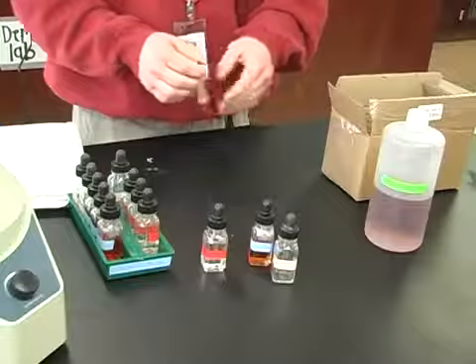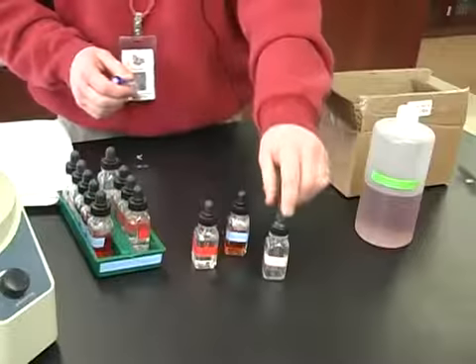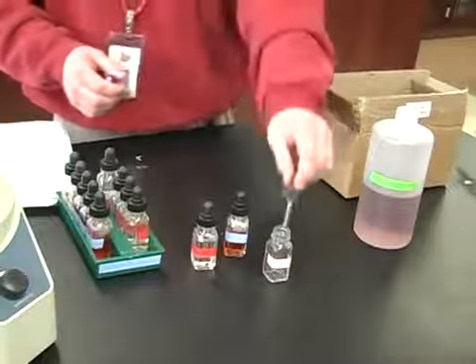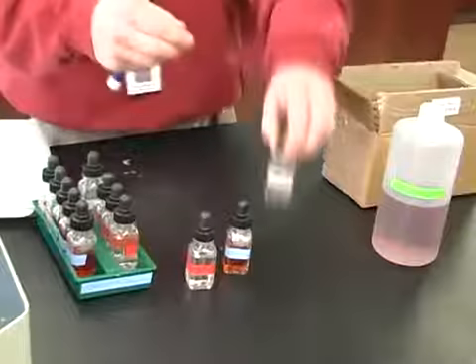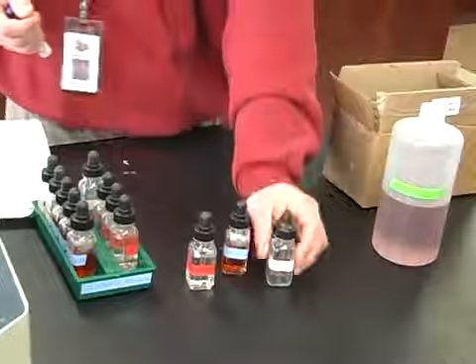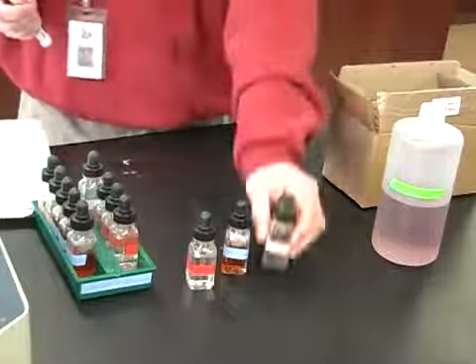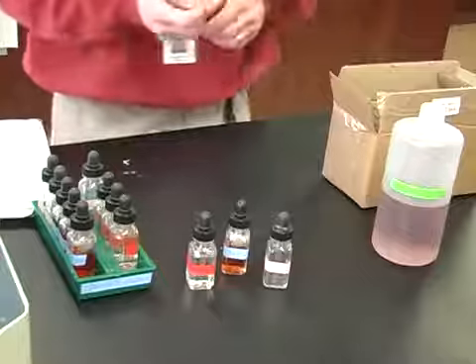When you pick up a bottle, never pick the bottle up by the cap, because just in case somebody would leave the cap loose, maybe you'll pick it up and boom, over it spills, and now all the solution tips onto the table before you put it back on the table. And second of all, just for added safety, always make sure to pick up the bottle by the bottle, not by the cap, just in case somebody forgot to put the top on tight.